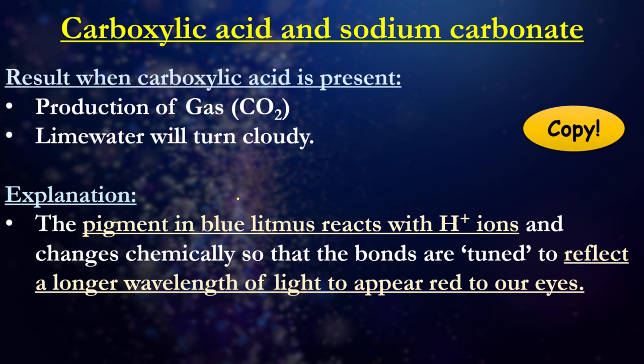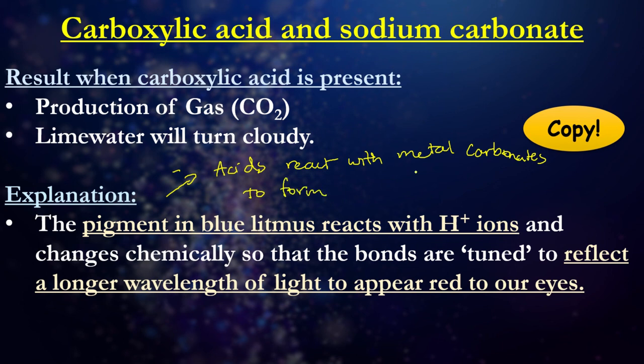So, and I do apologize I didn't fix this one up, but the idea is very simple. So we know that acids react with metal carbonates to form CO2.